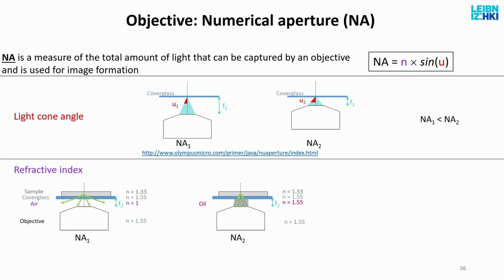Now, why is that? It is because in order for the light not to enter the lens, after it entered the oil droplet, it would have to exit the oil droplet. But now we are going from oil, which is 1.5 refractive index, to air. What do I get there? I get total internal reflection.